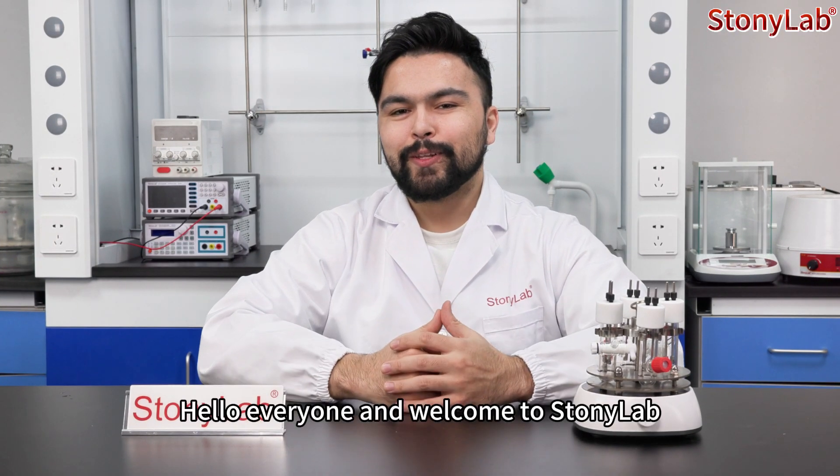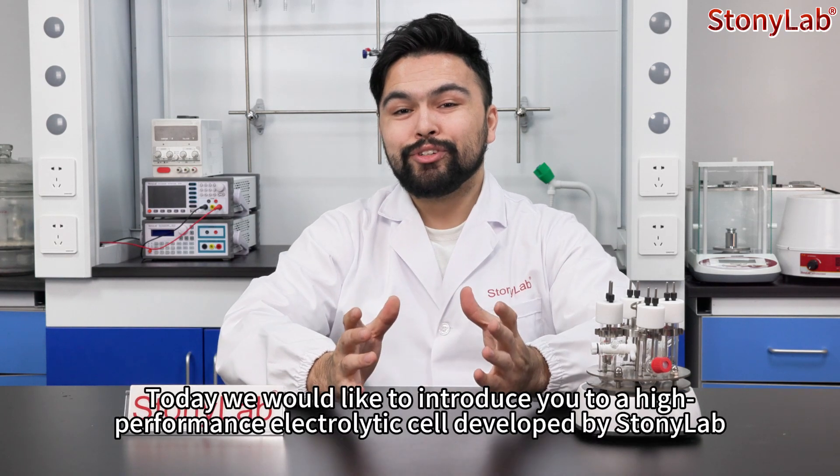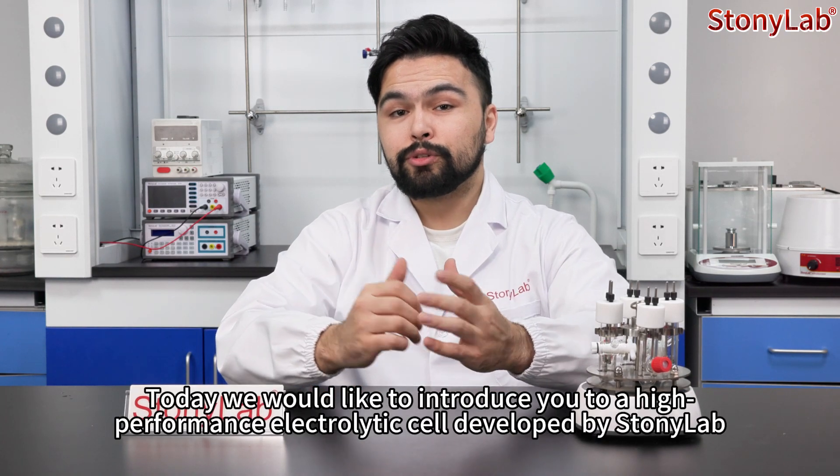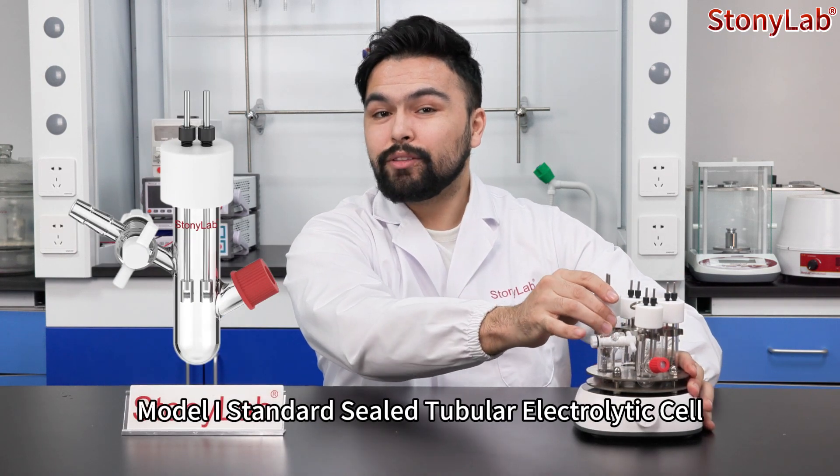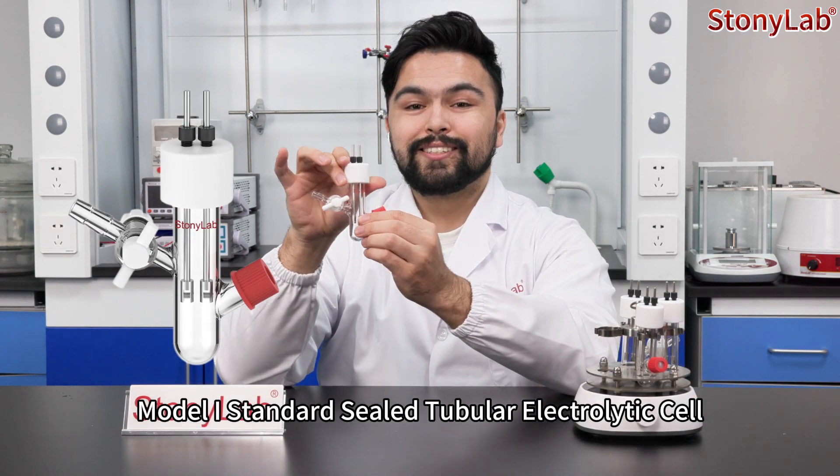Hello everyone and welcome to StonyLab. Today we would like to introduce you to a high performance electrolytic cell developed by StonyLab: the Model 1 standard sealed tubular electrolytic cell.